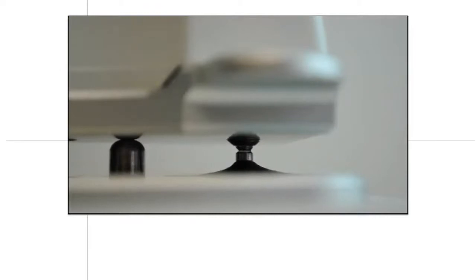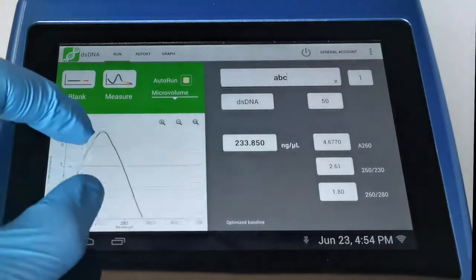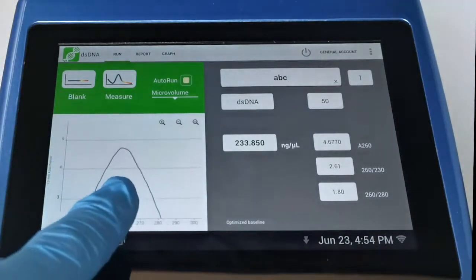This is a phenomenon you might observe on instruments that stretch the sample between two measurement surfaces. And it's a situation where the sample doesn't bridge between those measurement surfaces, and it results in inaccurate data. So returning to our sample, we can zoom in on our trace if we want to get a better look at this. We can zoom back out again.